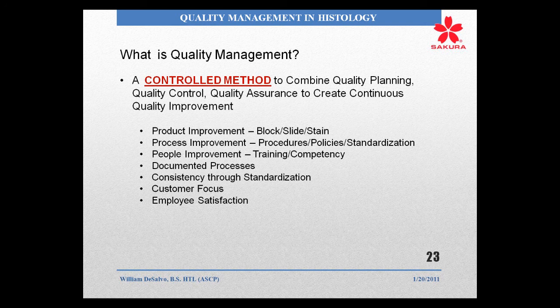And then you've got to document. You've got to have documented processes. I'm probably thinking that most of us have to have more documentation than what we have now. You do create consistency through standardization. Everything you end up doing in your laboratory is customer focused. And again, remember what we talked about at the beginning, for us it is a little bit more of a minefield to walk through because we have multiple customers. But you can't just please the pathologist. You've got to make sure that what you're doing actually meets the customer and patient needs. And then, again, you get that employee satisfaction.